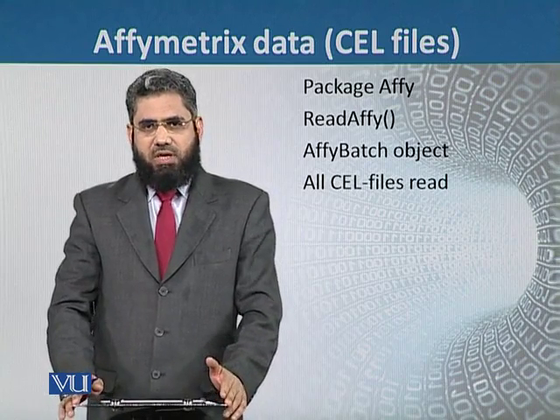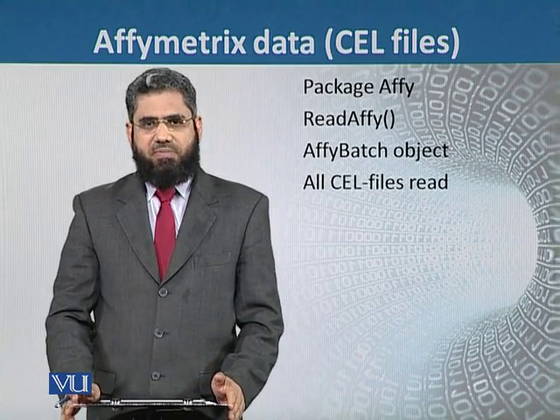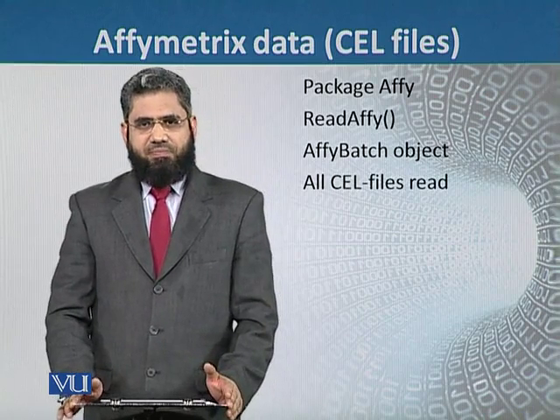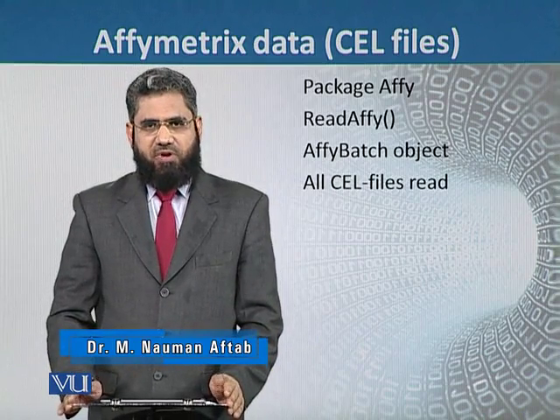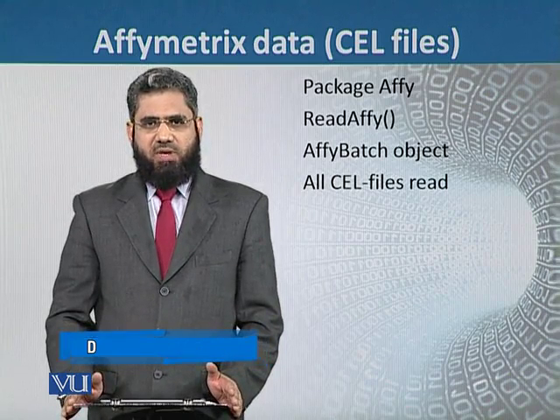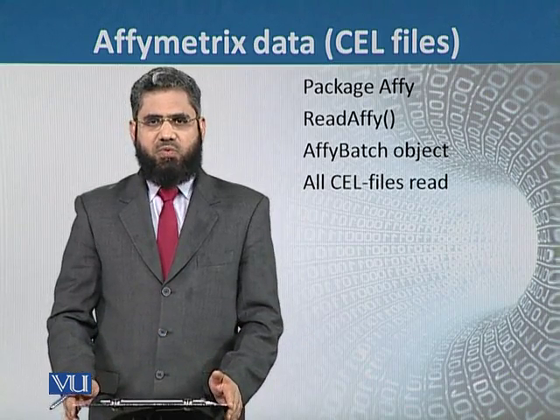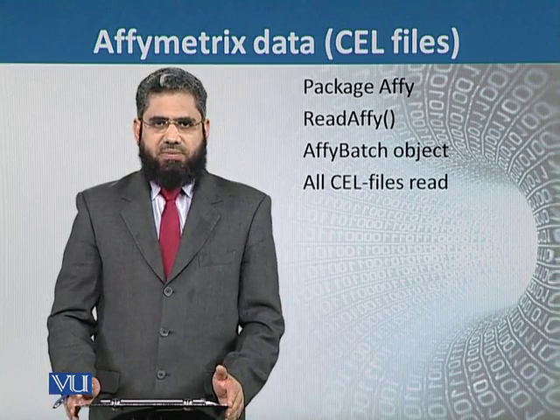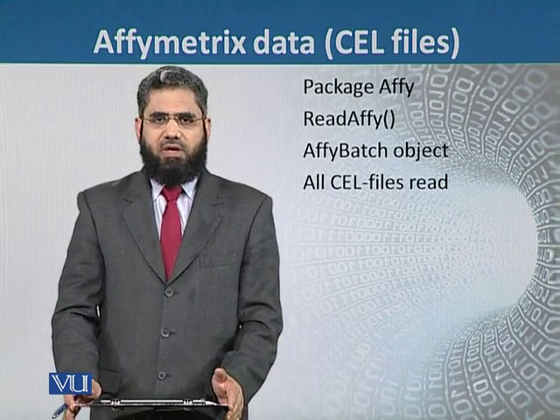So before going into the details of how we can import the data to analyze the data generated by these chipsets, we have to know how this data is generated. Very briefly, I will tell in a few lines: if we want to study genomics data, we have to perform whole genome studies, meaning the expression of all the genes present in a particular organism.